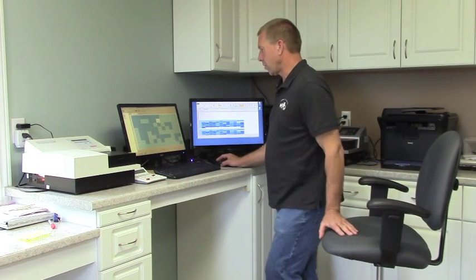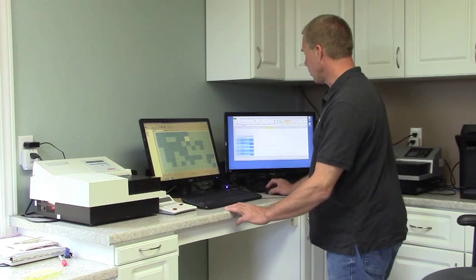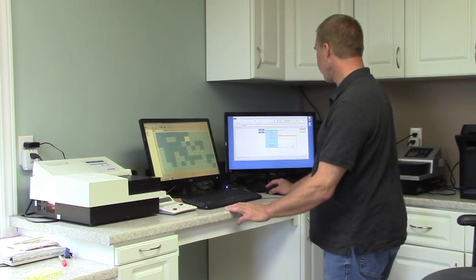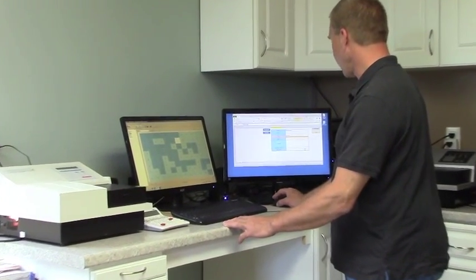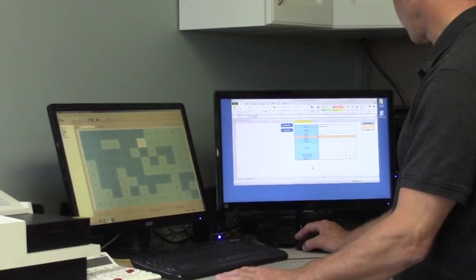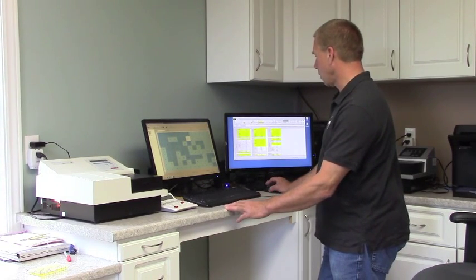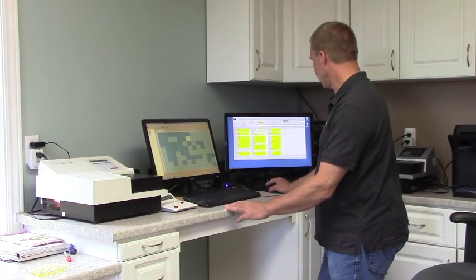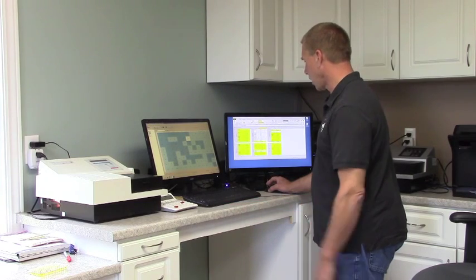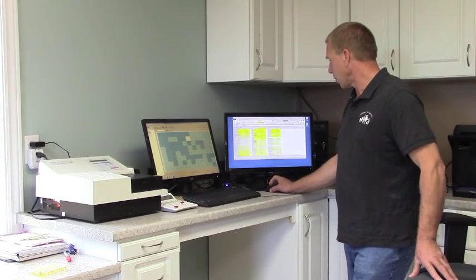We have some fairly good readings here — there's a very good one here, all these ones are reasonable, and in the dark shade there's nothing completely dark. The data is transferred over to the Excel program where we compile all the results and choose a cutoff. In this case this rancher likes a cutoff of one, which is a very good level for females — we usually use 0.5 for males. All these animals have their score right here, and that's where we get into a numbers game as to which ones to keep. The results are emailed to you or printed, and it's nice to put it on your iPhone and take it to the barn to decide which ones to keep and which ones not.